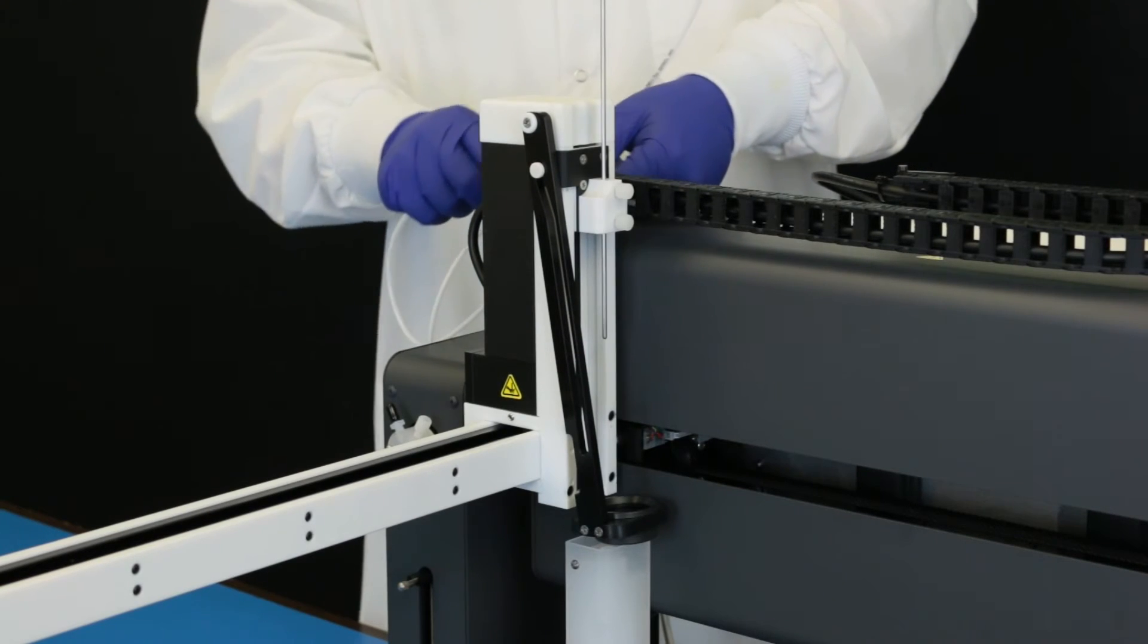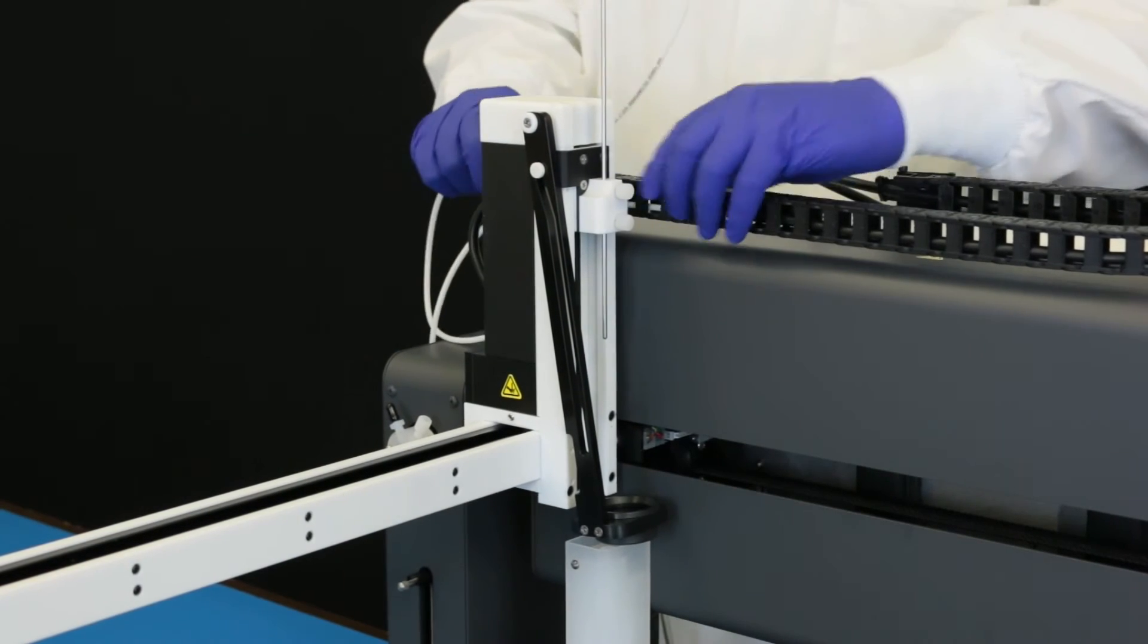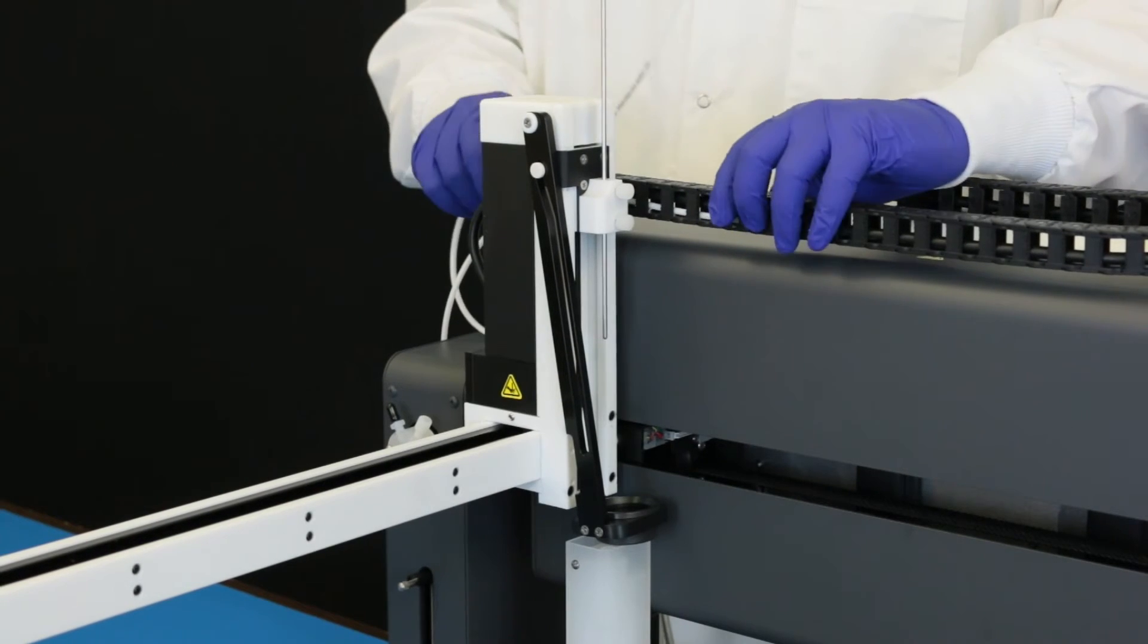Route the probe tubing through the chain on the top of the autodiluter. Check that the tube will not stretch or snag as the probe moves up and down.